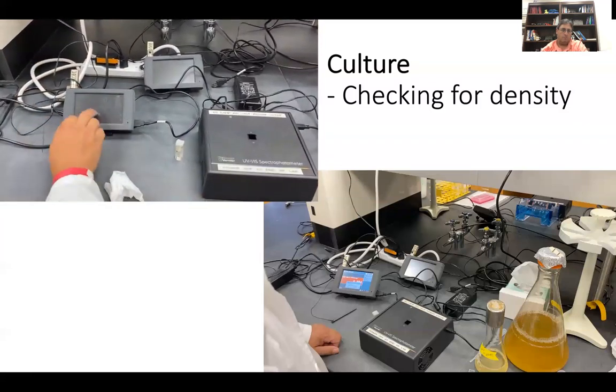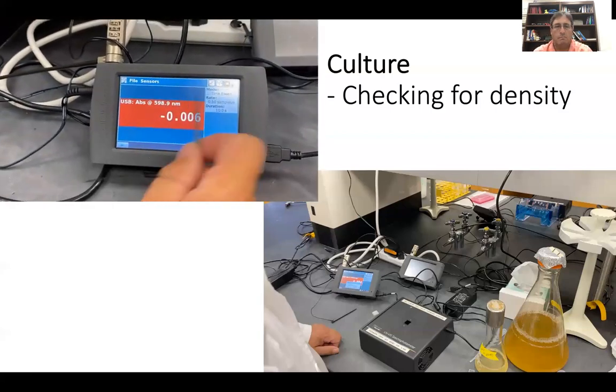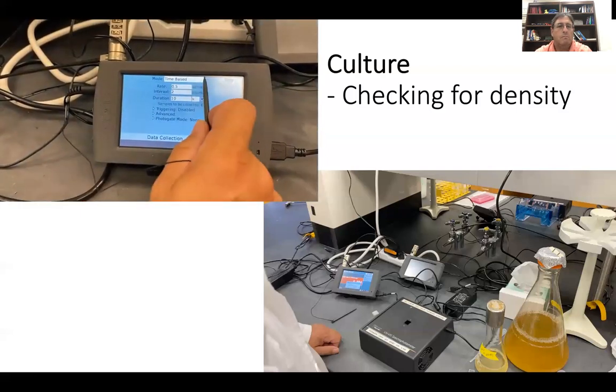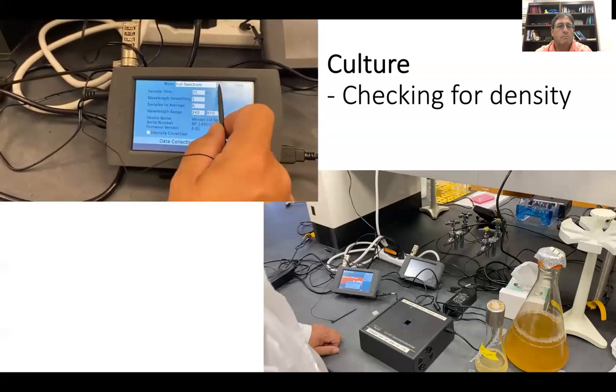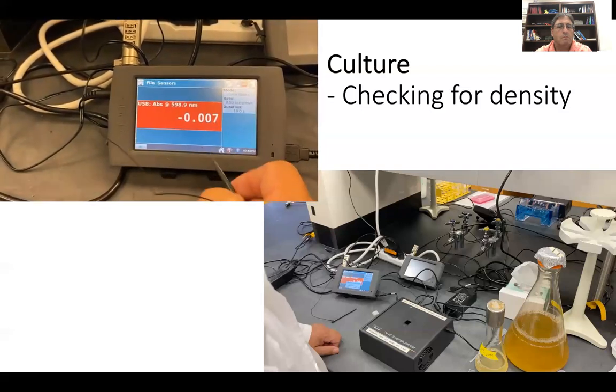So we'll start by waking up the spectrophotometer. In this case, we've already started it, but we'll go to a mode as a time base. For this one, it's nice and simple. If you don't have it on time base, maybe it's on full spectrum, you have to just select, in this case, the time base, hit OK.